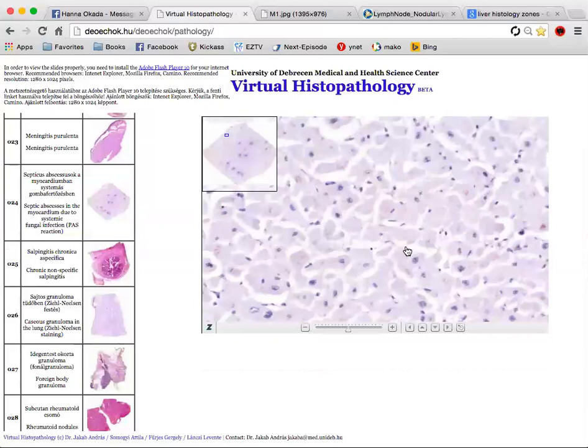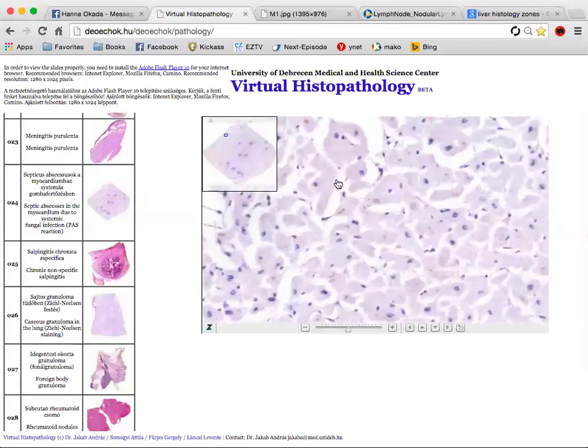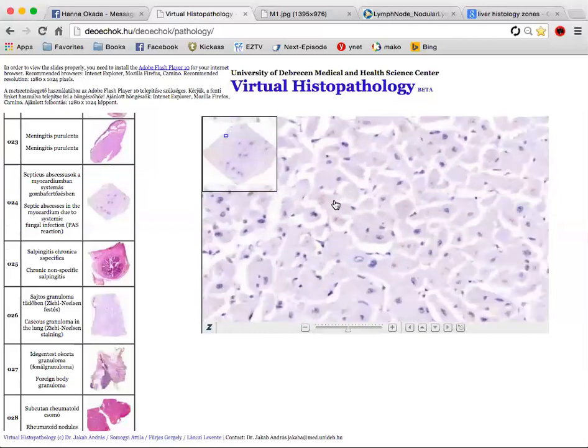So this person was sick, maybe he had AIDS, maybe he underwent chemotherapy. This wasn't a healthy person. That's why he had fungal sepsis. So all of this is lipofuscin, and that's because this heart muscle was suffering.